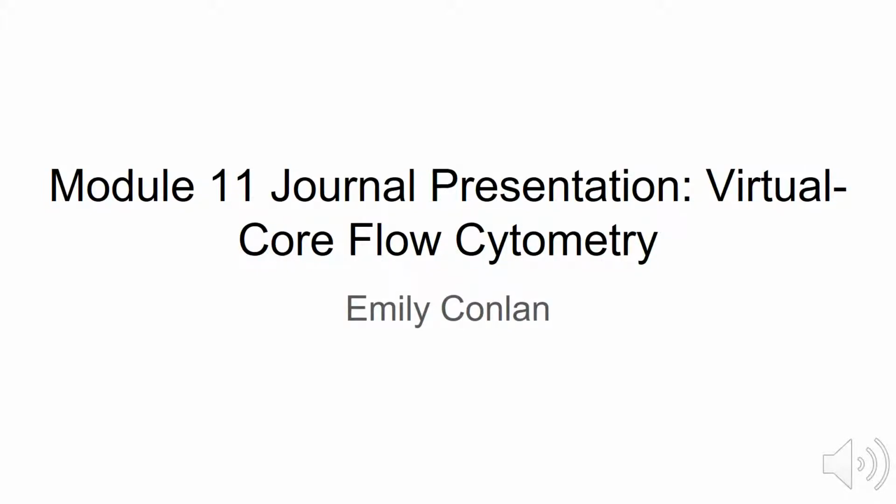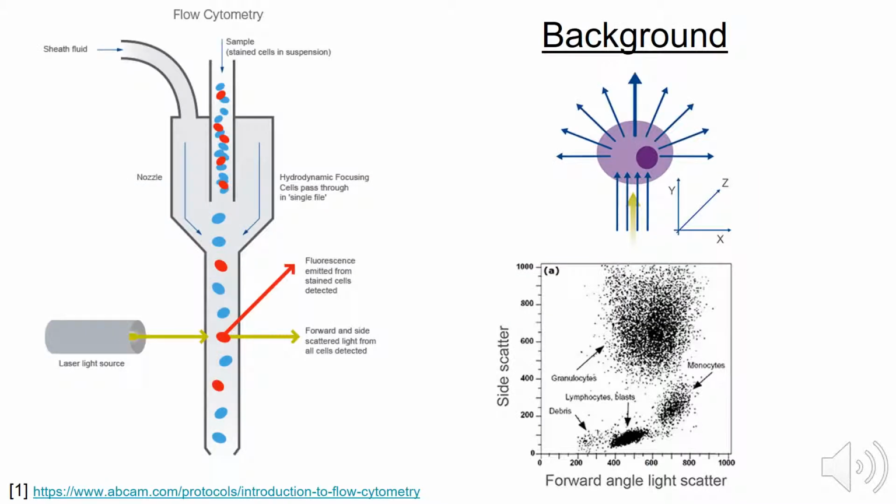Hello. In this video, I'll be presenting on the Module 11 journal article, Virtual Core Flow Cytometry by Swalwell et al. Published in 2009, which discusses an alternative method of cell analysis in flow cytometry. Flow cytometry is a technique used in many research fields such as oceanography, stem cell biology, and DNA analysis.